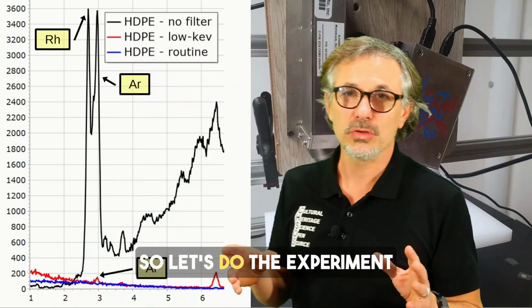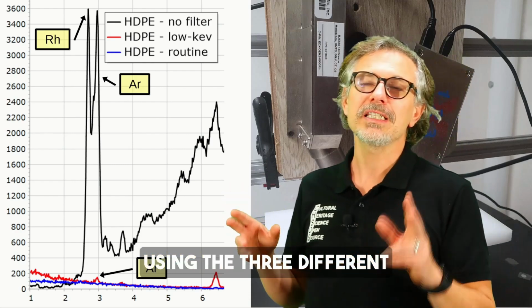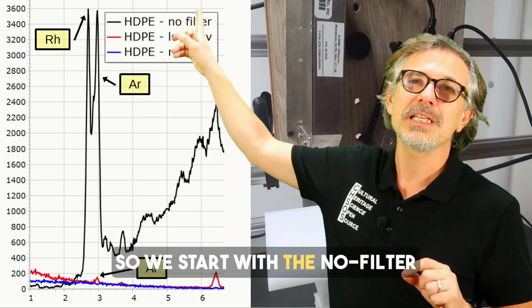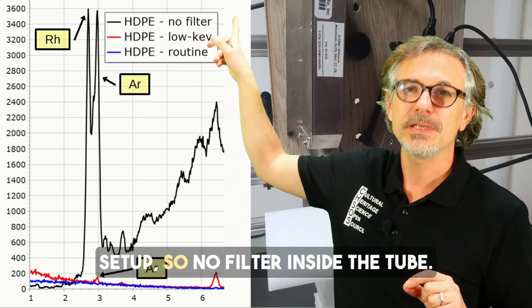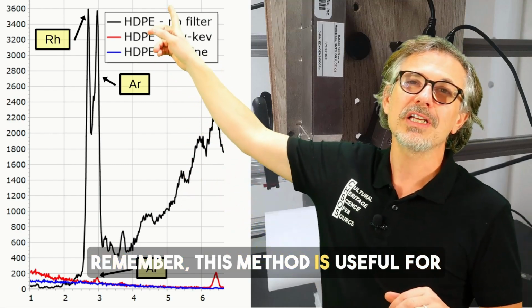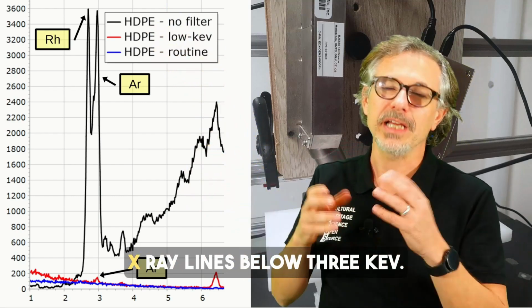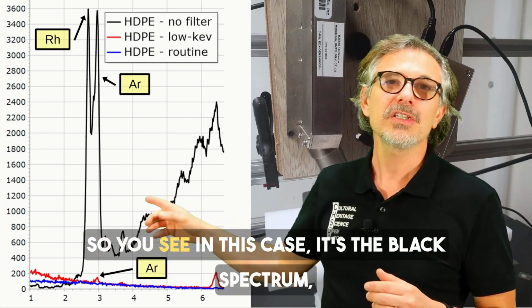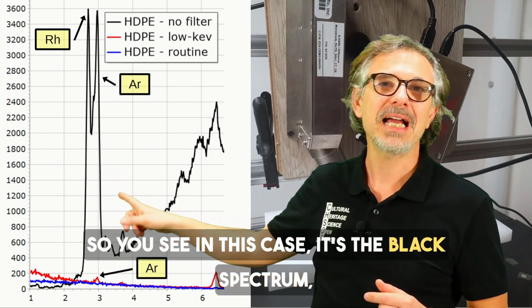So let's do the experiment using the 3 different filter setups. We start with the no filter setup, so no filter inside the tube. Remember, this method is useful for X-ray lines below 3 keV. So you see, in this case, the black spectrum.